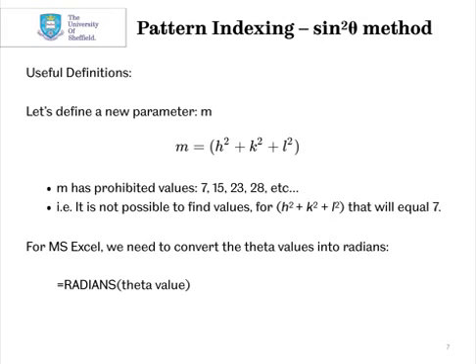The other thing to mention is that if you're going to do this in Excel, you need to convert your angular positions into radians.